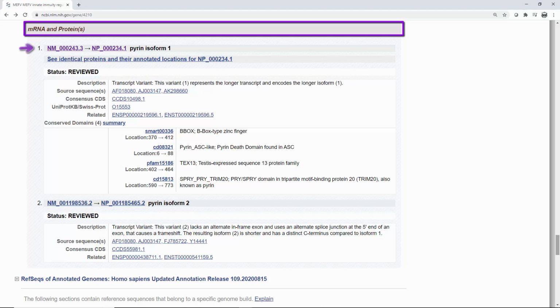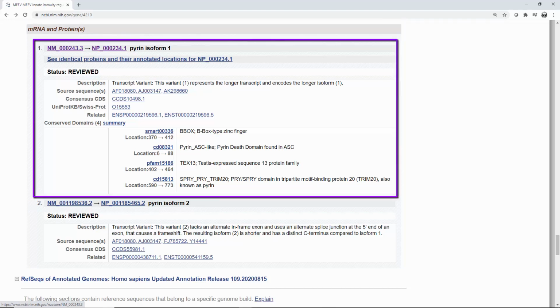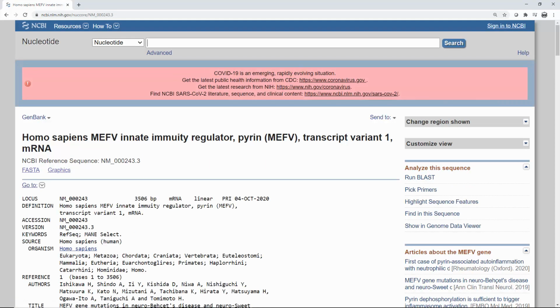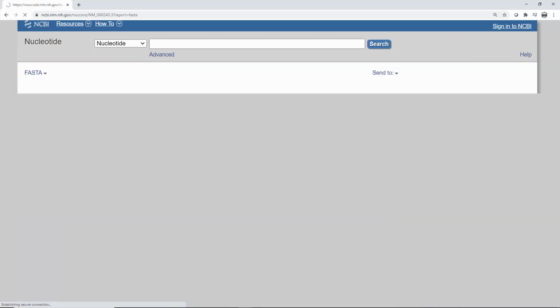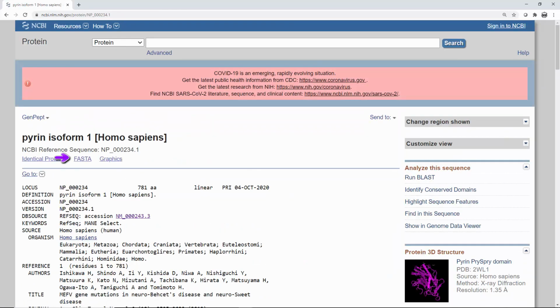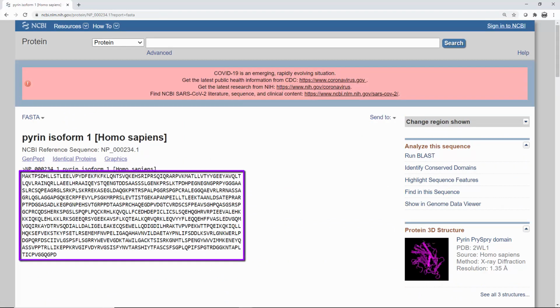This gene actually makes a couple different gene products, or isoforms. If this is the case for your gene, you can look at past research to decide which one to go ahead with. Let's just choose isoform 1 here. The first link will take you to the mRNA sequence, while the second leads to the amino acid sequence. Record both of their NCBI reference numbers. Clicking the links actually gives you a lot more than just the mRNA and amino acid sequences. But for now, if you just click on FASTA, you can get those sequences alone. We can learn more about the gene from this sequence info.